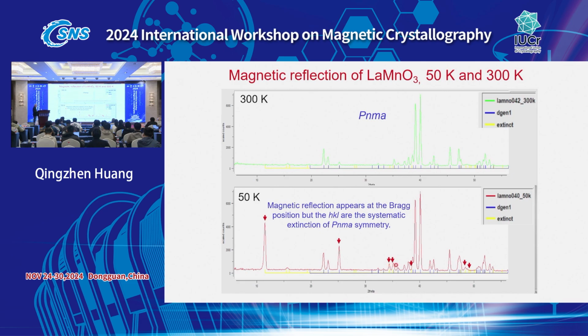So it's possibly magnetic. Some peak here. So you can use it to compare to the first step to see where the magnetic peak is. But maybe it's not magnetic. That's something we need to consider very well. Maybe it's a phase transition.